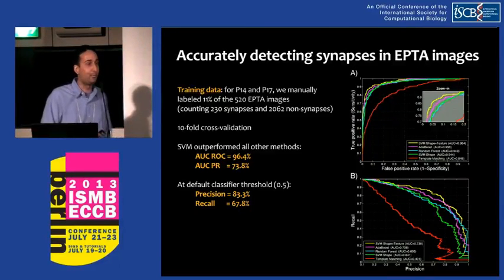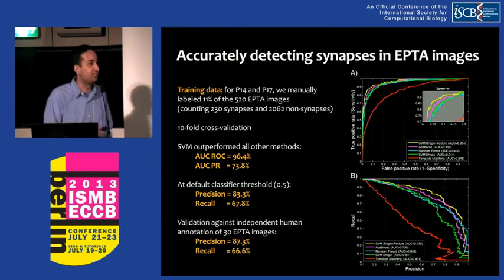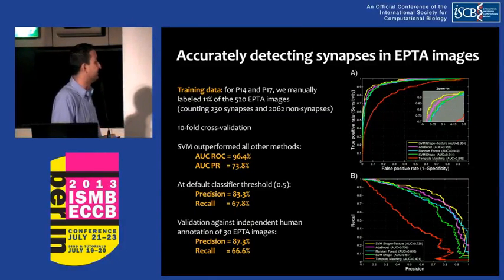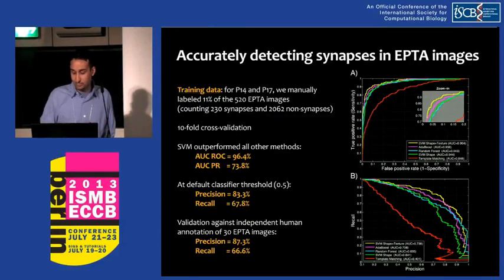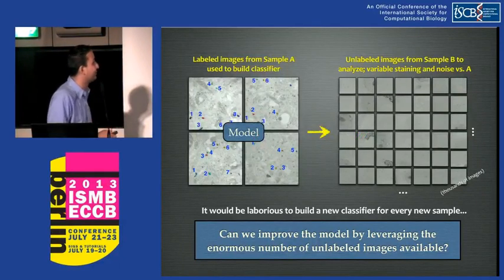So we're like, okay, fine, why don't we get an independent expert to come and label these images, and then we'll run our classifier on those and see how well it performs. And we basically see very similar numbers in that. So these numbers are not bad, but we started using this technique, and we came to this interesting problem. So what did I just describe?